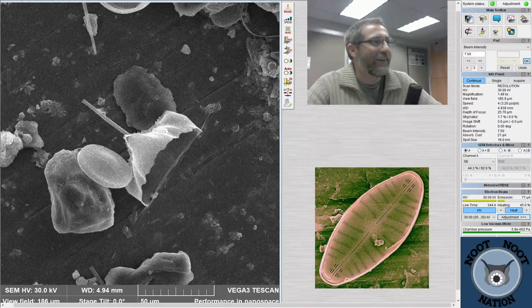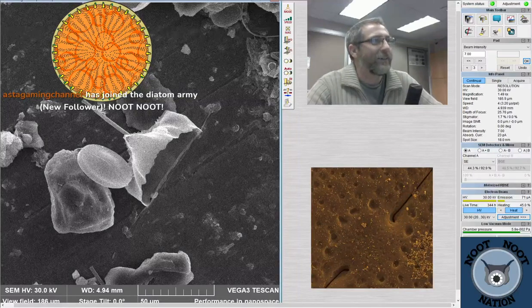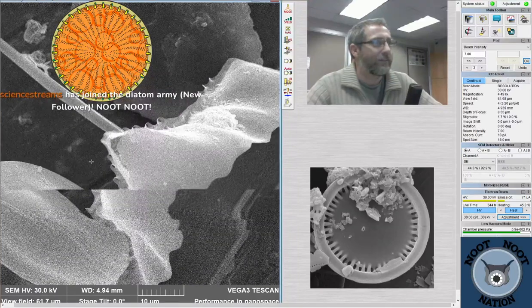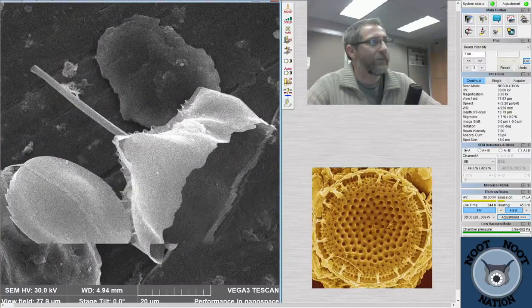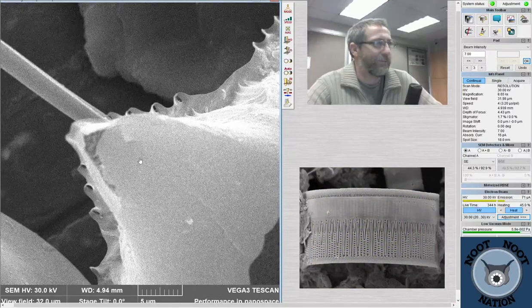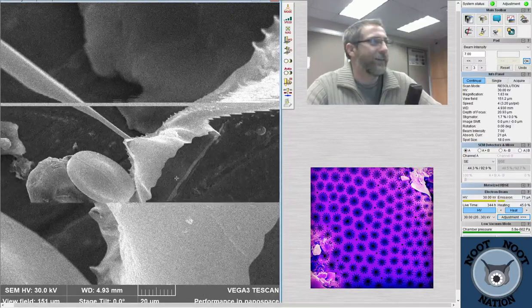Welcome, raiders. I am Diatoms Attack, and we are looking at diatoms from San Francisco Bay on a scanning electron microscope streaming live on Twitch. Behind me you see my lab, and on the screen you should be seeing a cool diatom that we see on Pacific Plankton streams sometimes. We always say it kind of looks like a Toblerone. It's shaped like a triangular prism. And on the edges it has these sort of flame-like structures, which I like to call eyelashes.